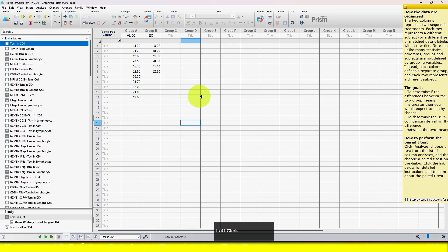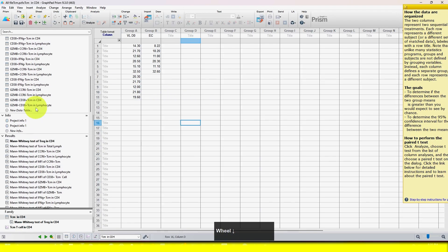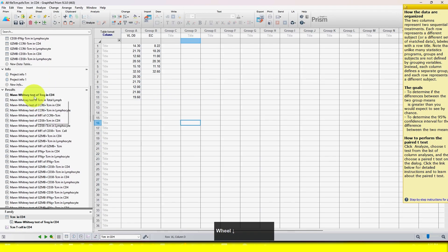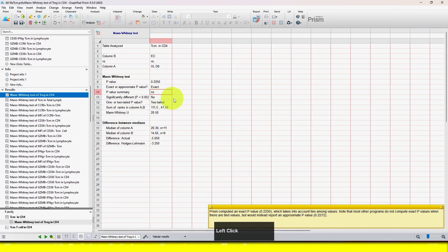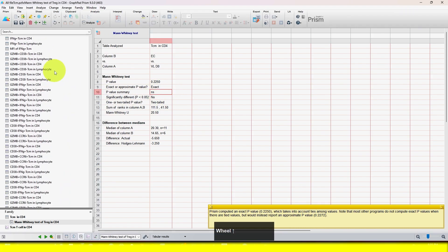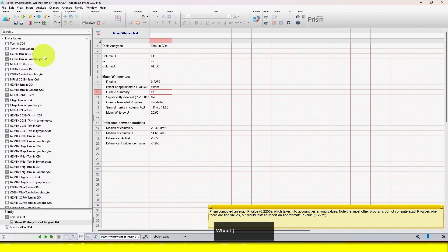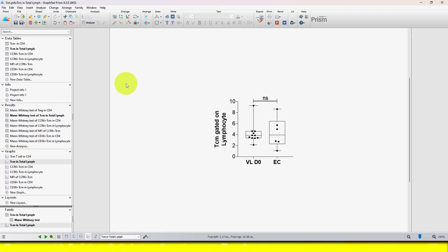So this is a very annoying situation. If you want to see the result and the statistics value — like whether it is significant or not — you have to scroll down again and again. So how can you solve this problem?